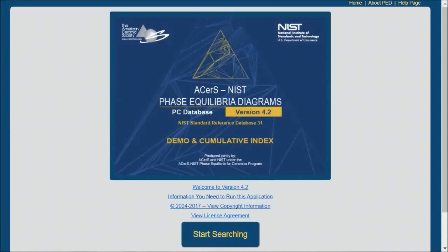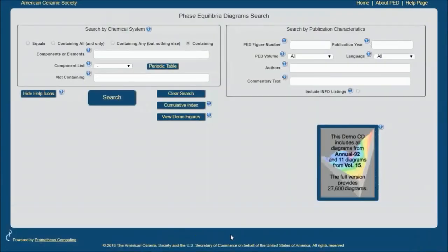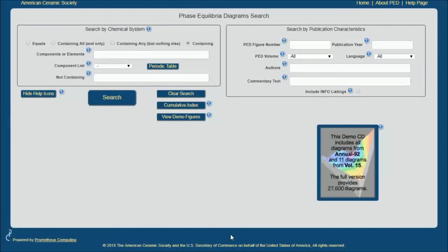Let's get started by clicking on the start searching button. This is the search screen. You'll probably use the functions on the left-hand side of the screen, especially when you first start using this software.